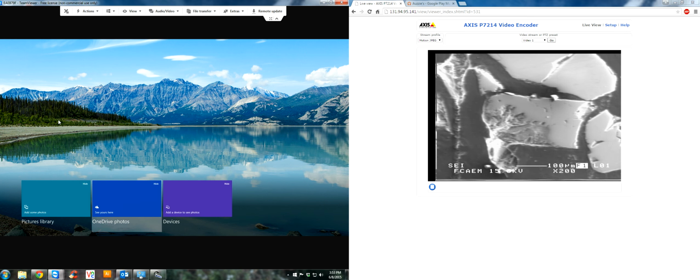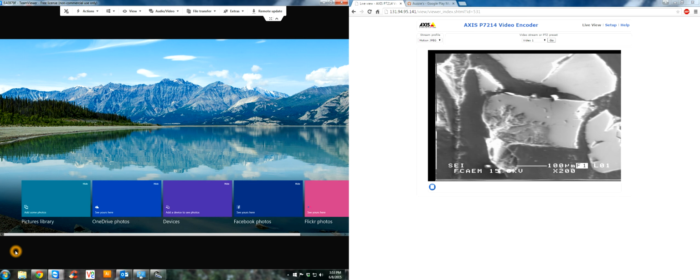So let's bring this over. You can just drag it over to the desktop here if you want to, or if you have a specific folder on the jump computer. Let's take a look at it, see if it worked. It's a big file, so there we go. Yeah, so it worked and it looks nice. So that's how you would... Oh, jeez. Okay, there we go. And here's FileZilla.